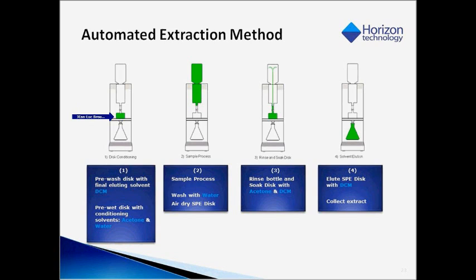During the sample cycle, the sample bottle, the water inlet valve, and the solid phase extraction disk holder are shown in green. During the rinse cycle, rinse solvent is sprayed into the sample bottle, which drips down onto your solid phase extraction disk holder as displayed in green in this scheme. Finally, during the elution cycle with methylene chloride or DCM, the collection vessel is displayed in green.